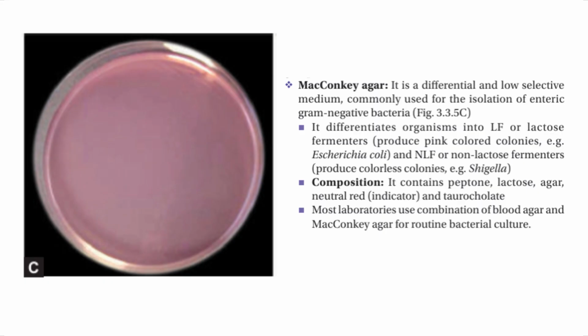Now let's talk about differential media, specifically looking at MacConkey agar. Instead of inhibiting the bacteria, this plate actually color codes them based on their biochemistry. It's brilliant. If a bacterium ferments lactose, take E. coli for example, it produces acid and creates these beautiful, bright pink colonies.